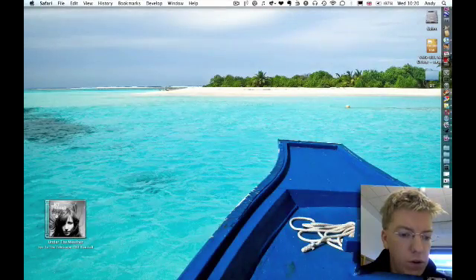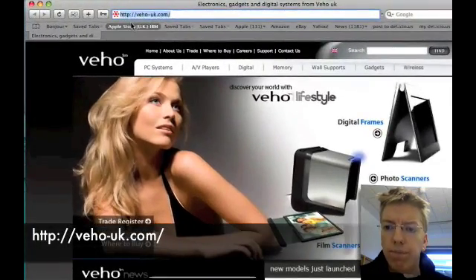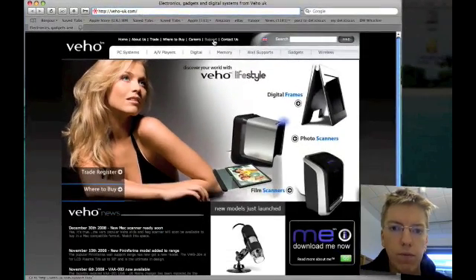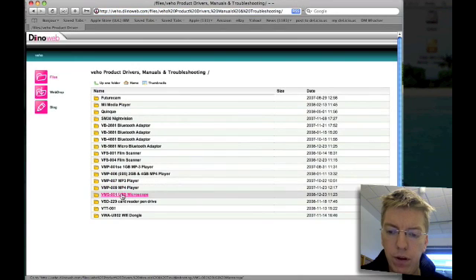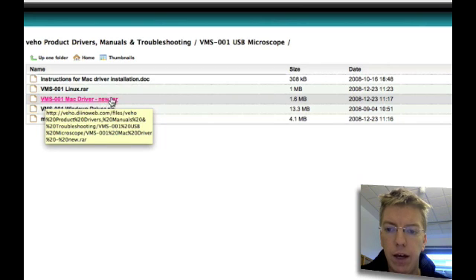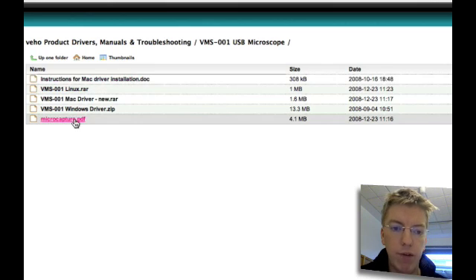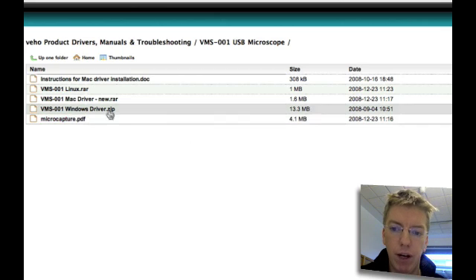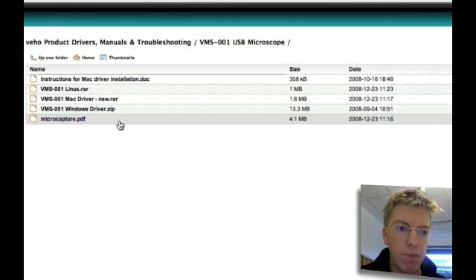Let's have a look at how to install the software for Mac. First of all, go and get the Mac software from veho-uk.com. Go to the support section, then the download center, then the product drivers, and find the directory for the VMS001 USB microscope. The files you want are the VMS001 Mac driver. I actually didn't find the instructions for Mac driver installation were correct, so download the microcapture.pdf, which is more up to date and matches the date of the Mac driver — they're both dated the 23rd of December.